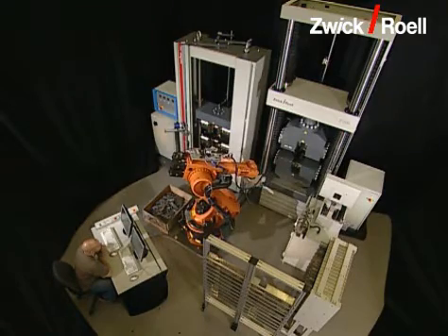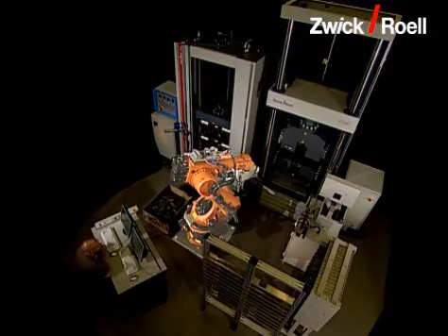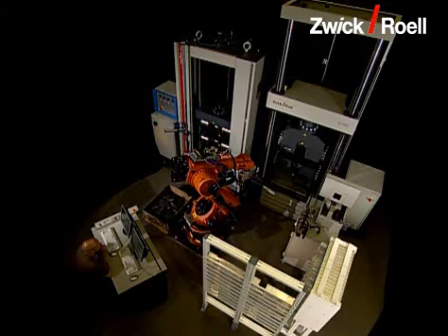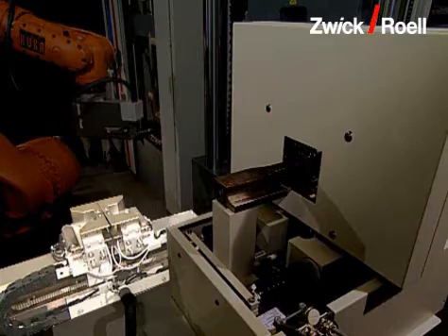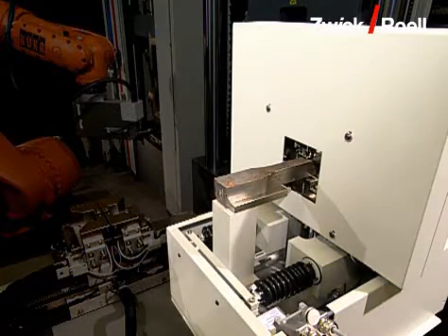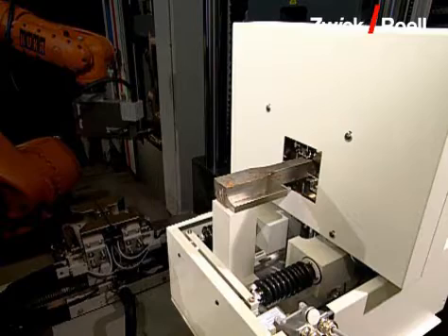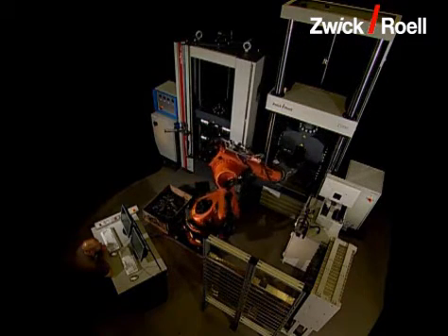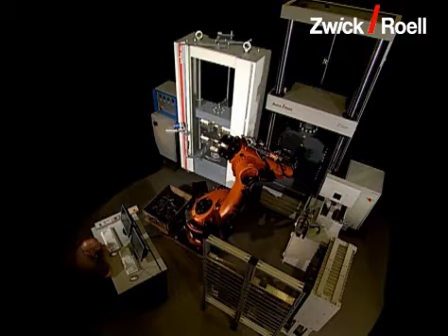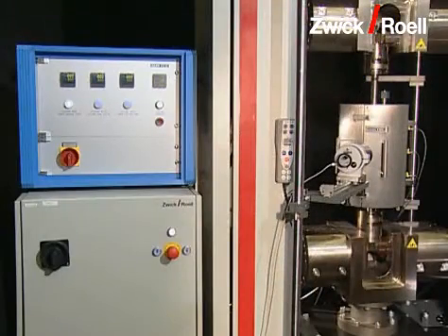The testing unit consists of the following single components: the robot for the transport of the specimens to the different stations; the specimen magazine for different specimen sizes; the specimen centering station for aligning the specimen; the cross section measuring unit for the determination of specimen width and thickness; testing machine 1 for tensile tests up to 1200 kilonewtons; and testing machine 2 for tensile tests up to 600 kilonewtons.